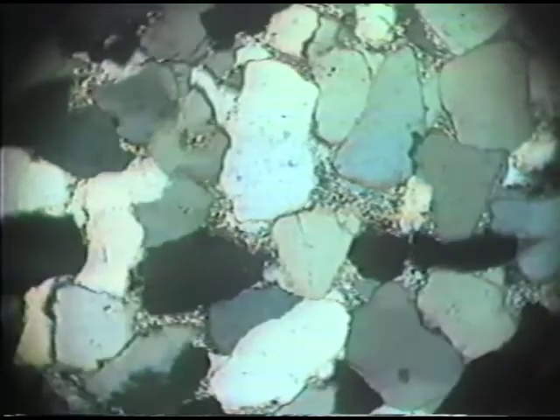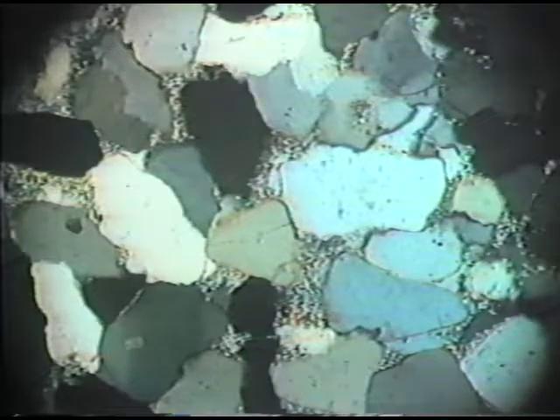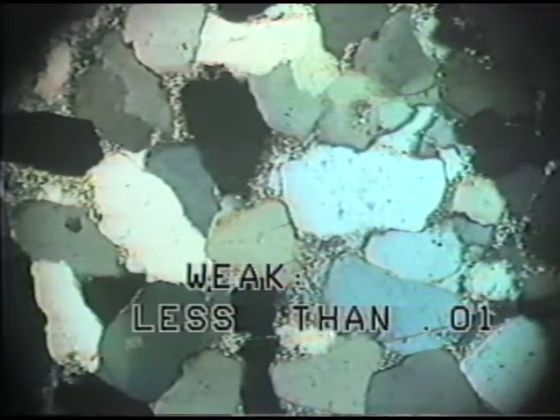This is an indication that we're dealing with weak birefringence, that the birefringence for this particular mineral is less than about 0.01. That is the absolute value of the difference between epsilon and omega.